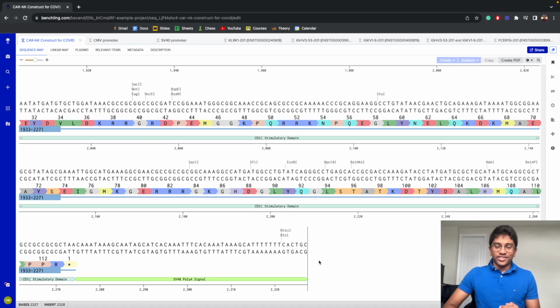As you can see, it's a very complicated process, but it's actually not too hard to get these sequences yourself. I used different research papers and articles to get sequences. I also used Benchling's gene database tool searcher, which allows you to grab genetic sequences. Another big tool is UniProt and the NCBI gene database, which have so many proteins that I used, and I can't thank them enough for providing these sequences to the public so people like me can work on stuff like this. And yeah, that's basically my whole process.